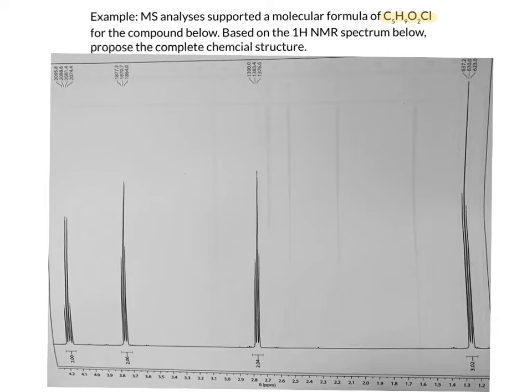You will notice in this proton NMR spectrum, we're not seeing the entirety of the range of the x-axis. We're only seeing from about 1 to 4 ppm. Generally the reason for this cutoff is so that we can zoom in on where we actually see signals in the spectrum. The parts that are cut off, you can assume there are no signals within that range. So the most downfield signal is right there at around 4.2. And we can conclude from this NMR spectrum that we have a grand total of 4 distinct chemical environments of protons because we have a signal here, here, here, and here.